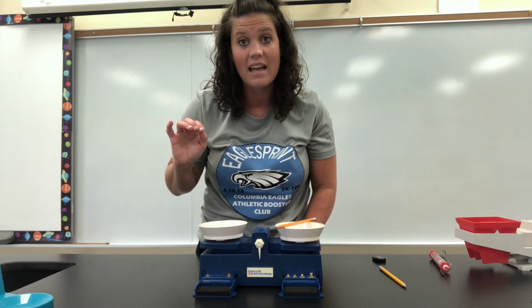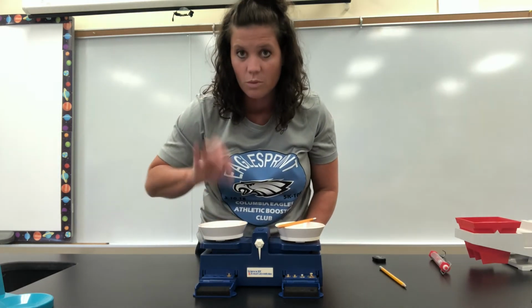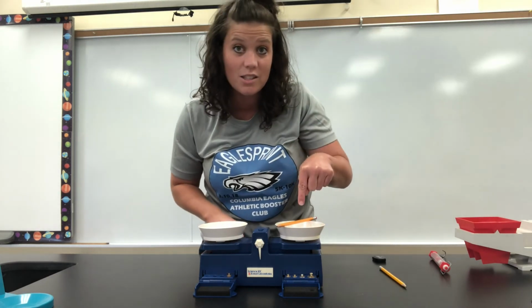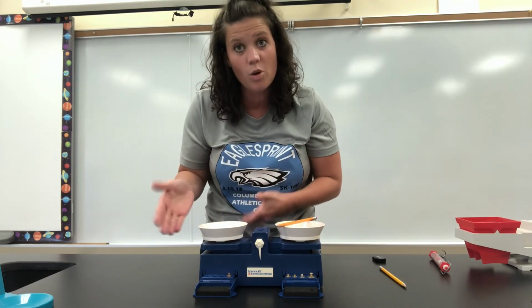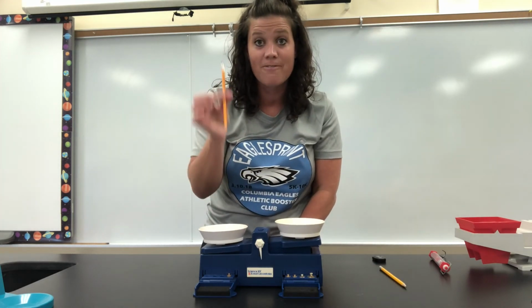and now it's balancing. Maybe I want my little 1, my little baby 1. And that's perfectly balanced. So this pencil, I now have a measurement for. It's 5 grams. The mass of this pencil is 5 grams.